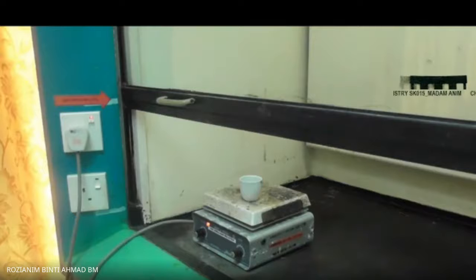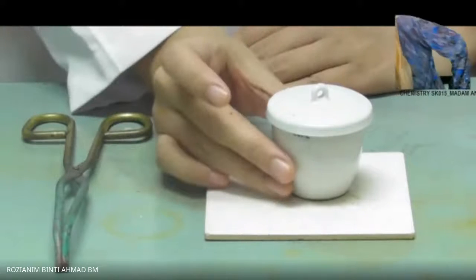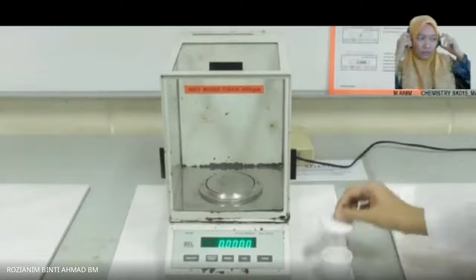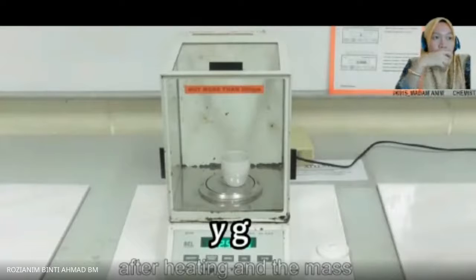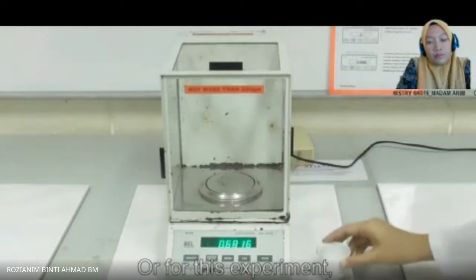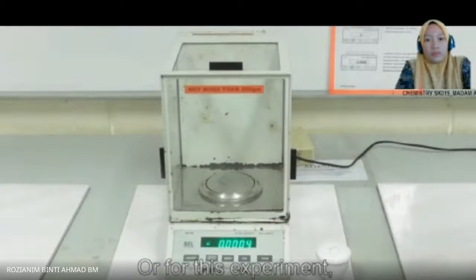So, repeat the heating, cooling, and weighing process until the mass after heating and the mass after the next reheating is constant. Or for this experiment, 0.02 grams of error is acceptable.